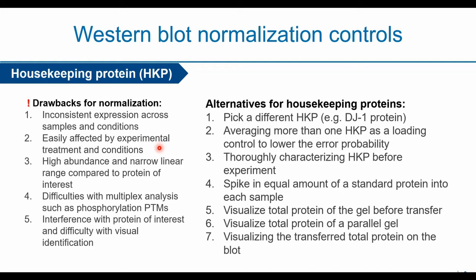And then, due to their high abundance or high expression, they have a narrow linear range compared to your protein of interest. So this is something very common. Thus you have the risk of saturating your blot later during the imaging step.